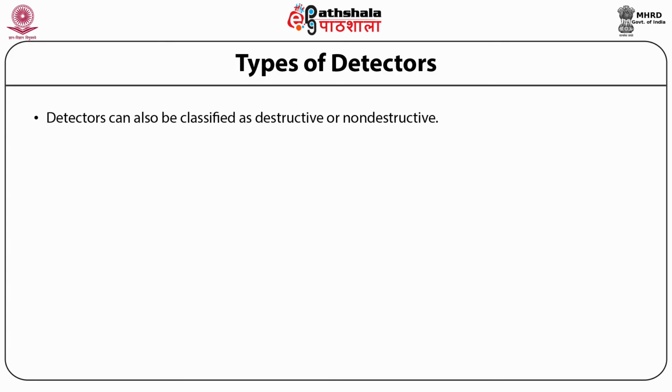Detectors can also be classified as destructive or non-destructive, depending on whether or not the sample components can be collected unchanged for further study. Hydrogen flame detector.